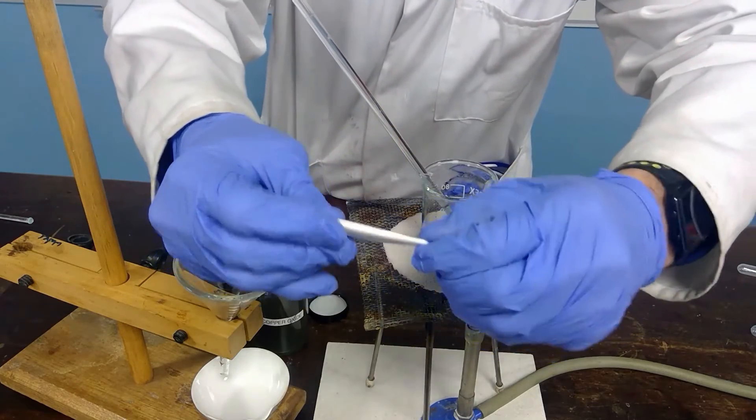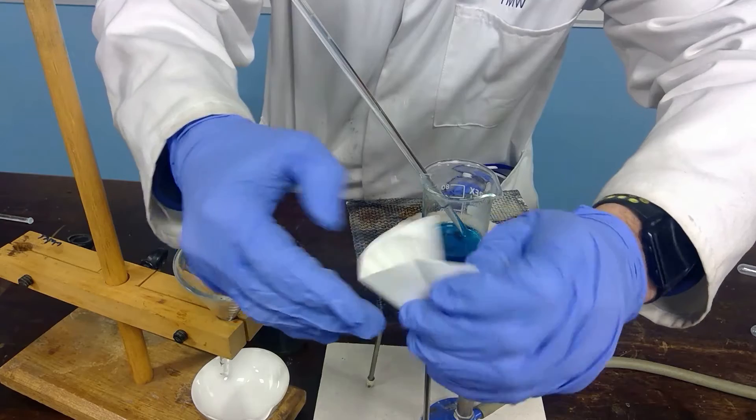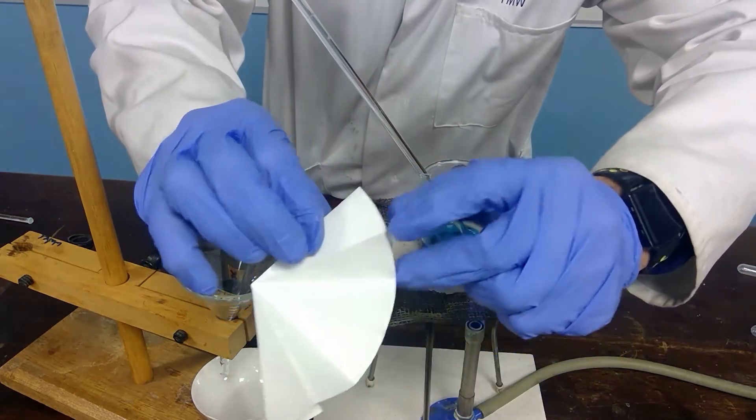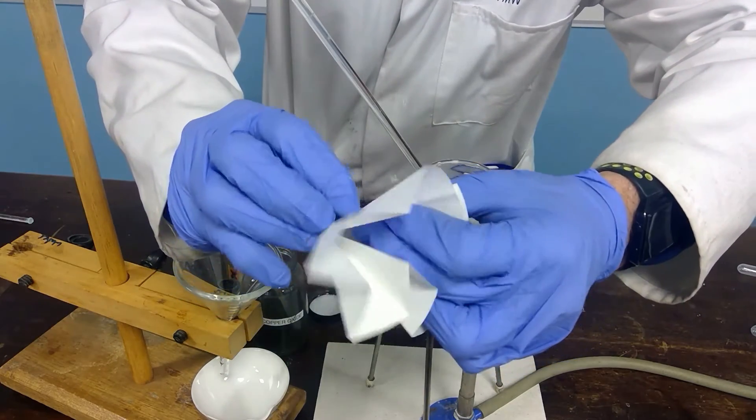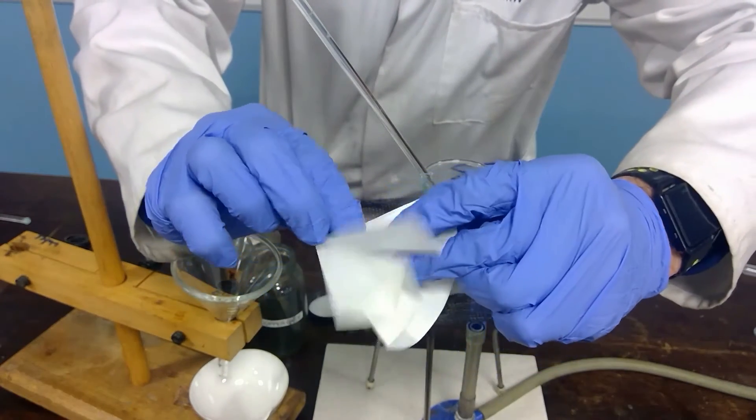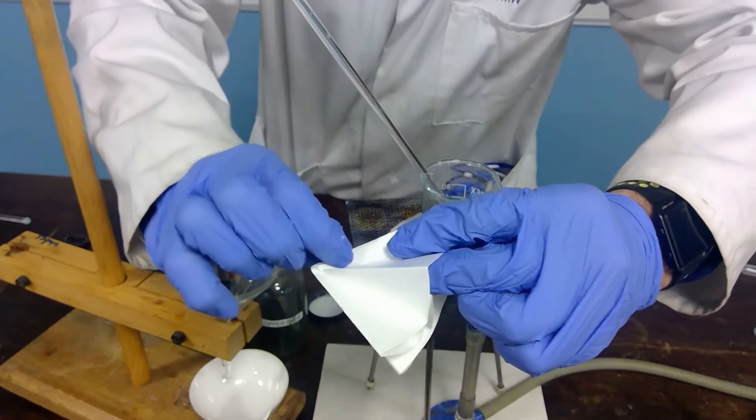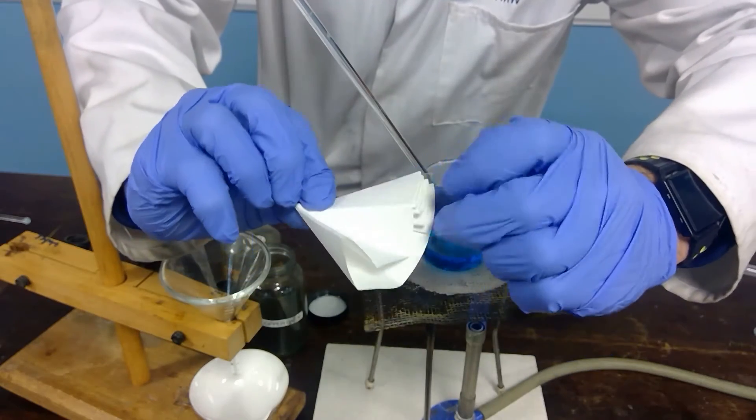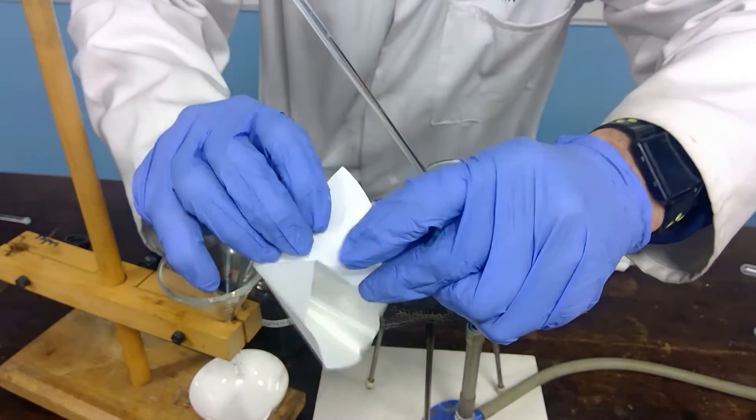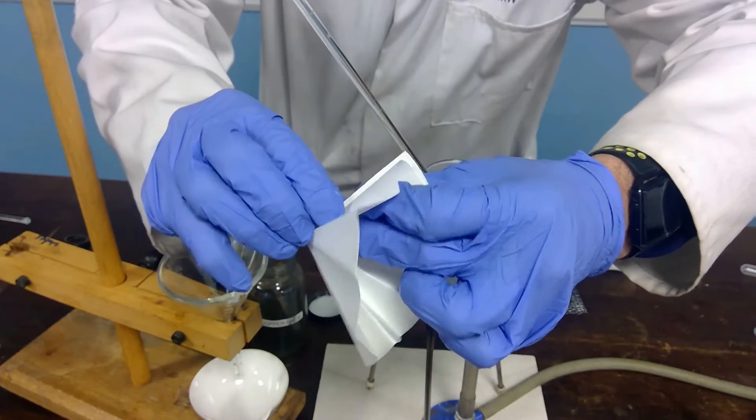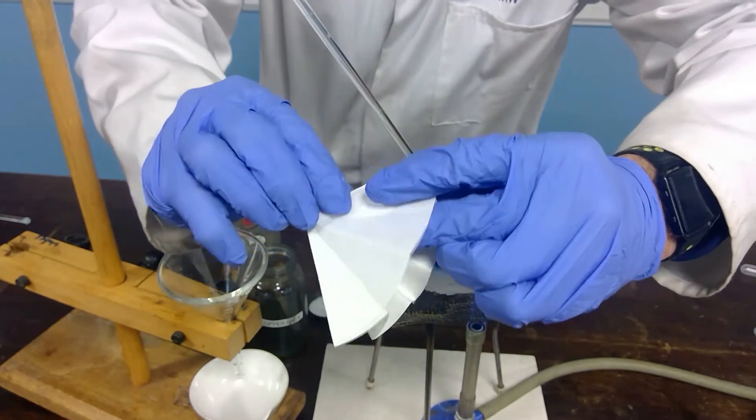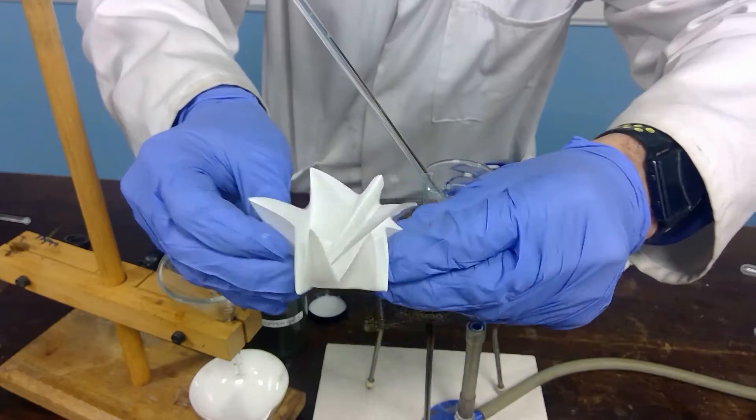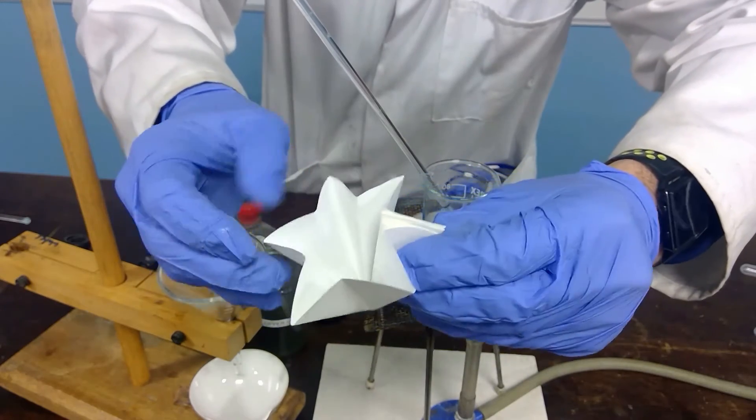Once we have done that we can open it up and start to fold backwards and forwards from a particular point. We just pinch and we fold backwards and forwards. And you get to a certain point and then open up a little and continue until eventually you're all the way around the filter paper. So you have the fluted filter paper.